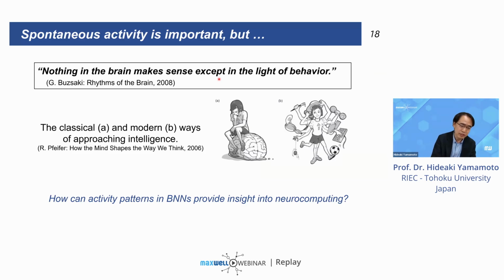And studying behavior in cultured cells is a bit tricky, but we can at least stimulate the cells and see their responses. And so we started building a setup to let biological neurons interact with artificial environments, and at the same time look for ways to interpret the evoked activity patterns from the perspective of computing.